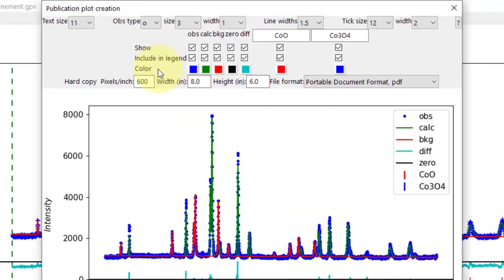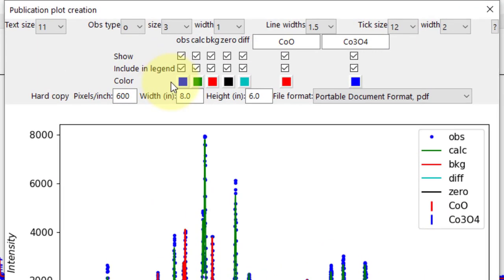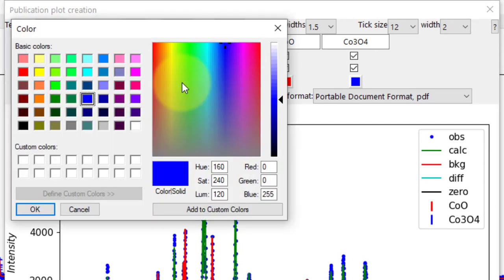We have a color selection option to change the colors of the observe pattern and other elements. I can choose a predefined color or customize my own.